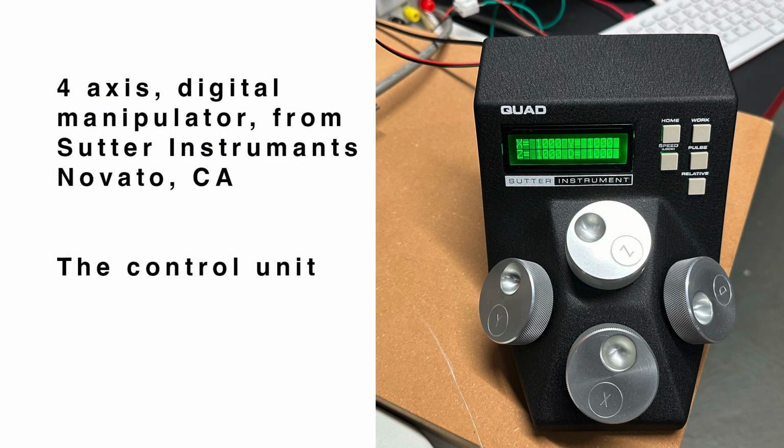My key instrument is a digitally controlled 4-axis micromanipulator. Here you see the control unit. Each of the knobs controls movement along one axis direction. X and Y define the plane parallel to the microscope stage, and Z is the vertical direction. D is the axis of the instrument that is being moved, which is adjustable. The position in these four coordinates is indicated in microns in the green LED window. Thus you can return to a predefined position with micron accuracy.